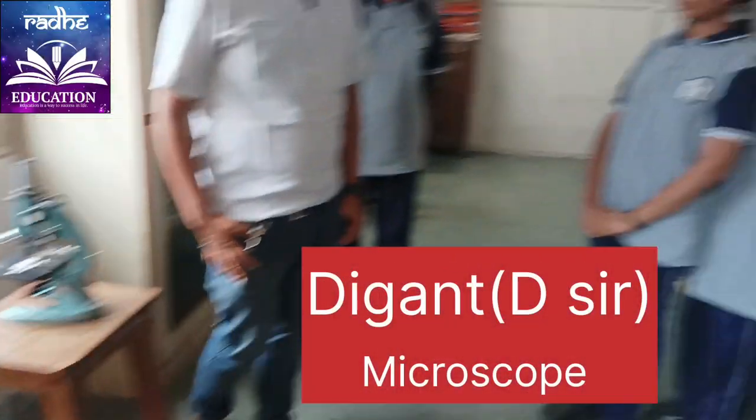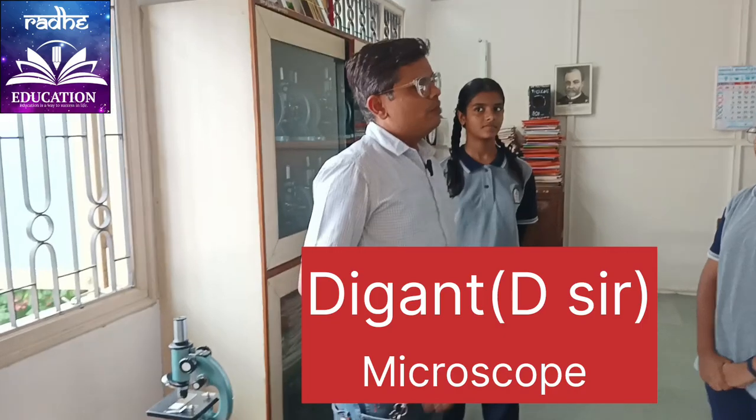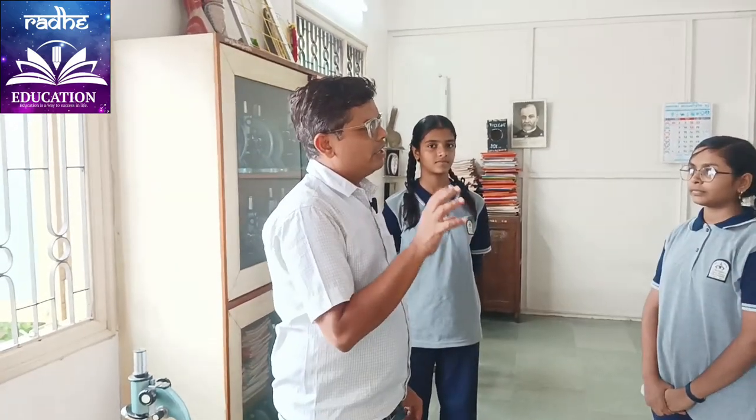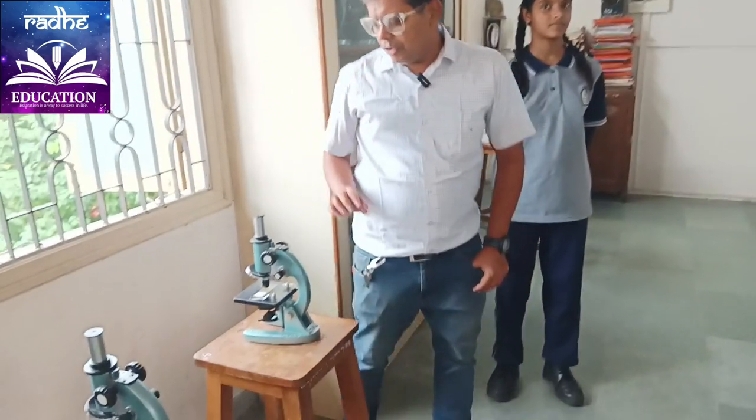Good morning, students. Today we are going to learn about the microscope. Micro means very small. Whenever we want to see a very small object or thing, we can use the microscope. In a microscope, different parts are there.